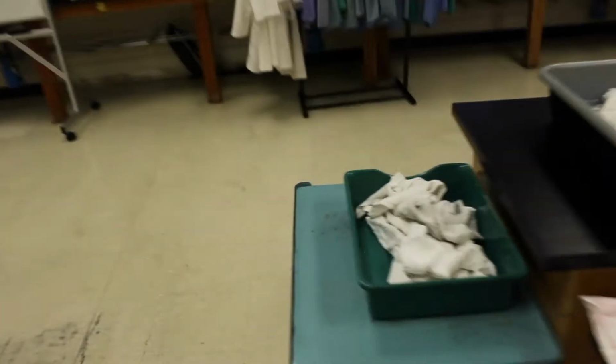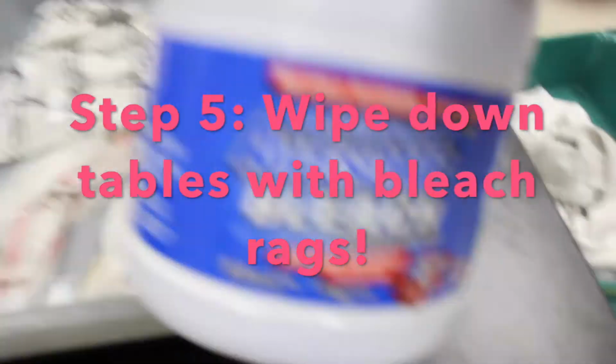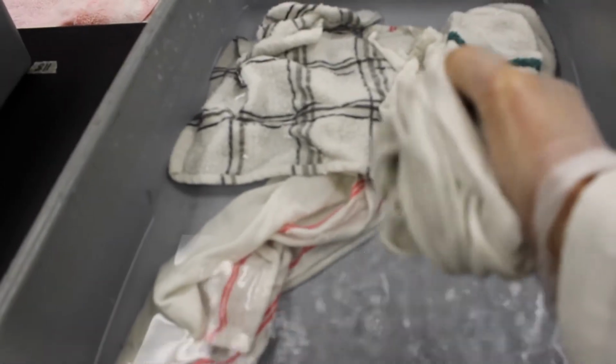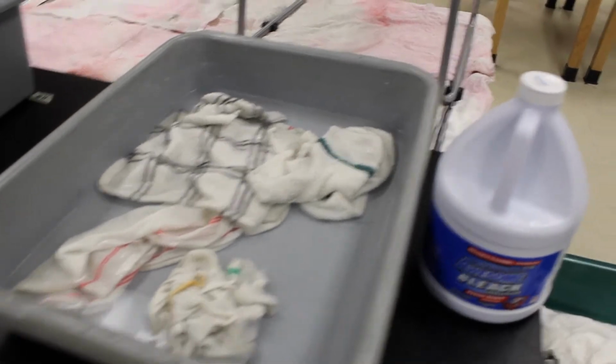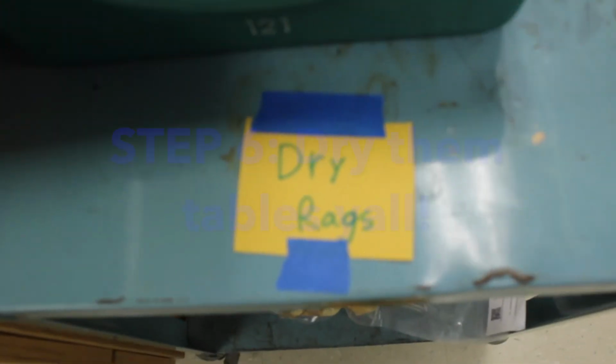Once you finish cleaning your tray, you're going to go over and you're going to get bleach rags. So these also have our bleach with the rags. This is going to disinfect the tables. So we'll take it, we'll wring it out, and then we can use it to wipe down tables and disinfect them. So once your table has been wiped down, our last step is you're going to get the dry rags.